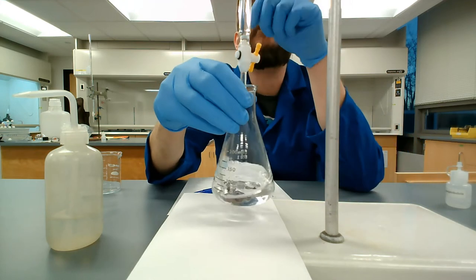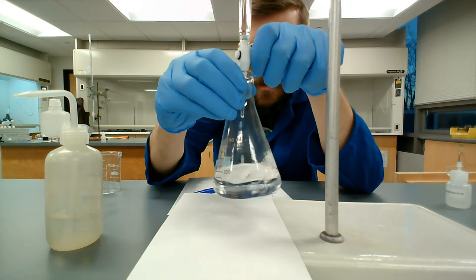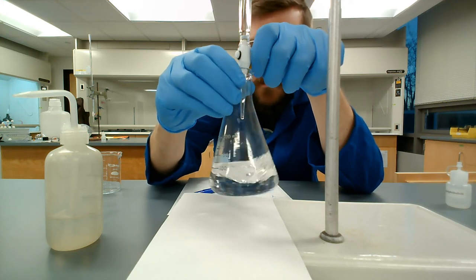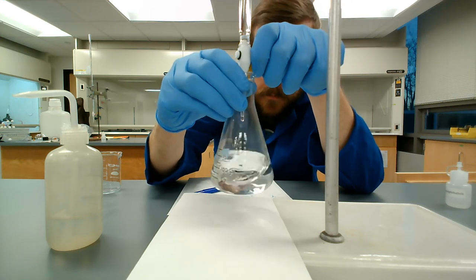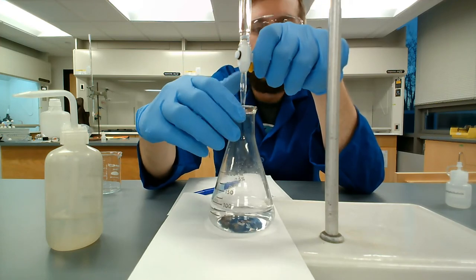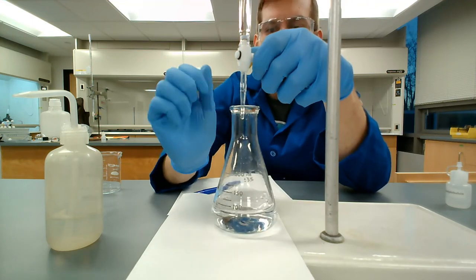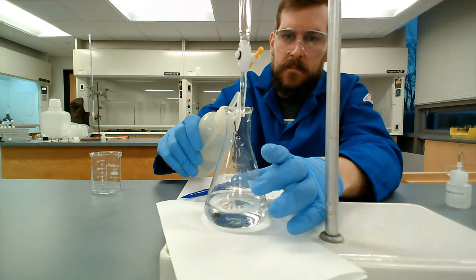Or, you know, as the solution swirls, it's sort of picking up colors in the room, as the light gets reflected at different angles, so I'll periodically stop here, right? Sort of slow down my swirling, but I'm doing still a drop a second, maybe a little bit faster, right? I think here's where I screw up. I'm slowing down. I think I'm getting close to the end point. I'm trying to demonstrate that I'm doing maybe like a drop a second here.